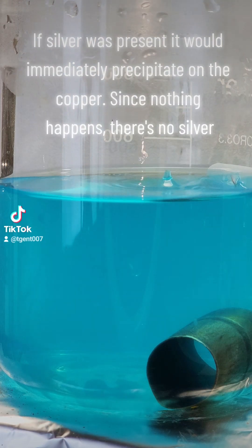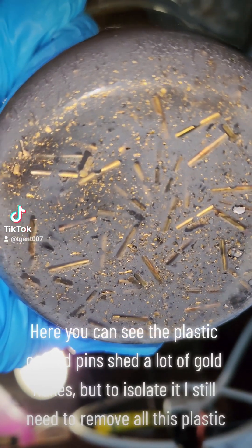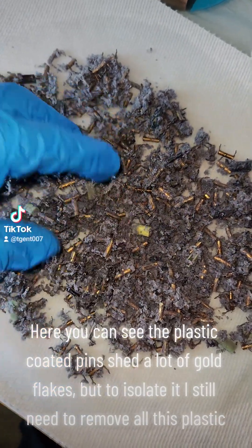If silver was present, it would immediately precipitate on the copper. Since nothing happens, there's no silver. Here you can see the plastic coated pins shed a lot of gold flakes, but to isolate it, I still need to remove all this plastic.